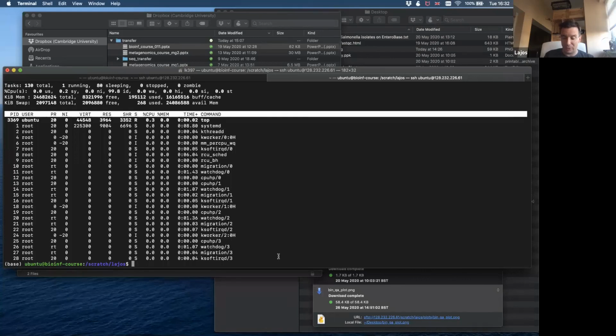As soon as you are doing eukaryotic whole genome sequencing, I think the de novo assembly is not really an option. Of course, if you are sequencing something that is not known and you have no chance to have a reference sequence, you have to do de novo assembly.